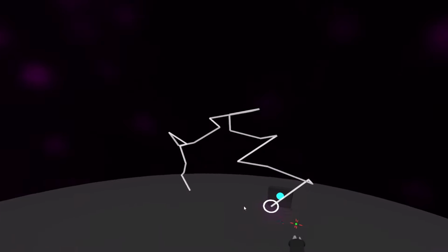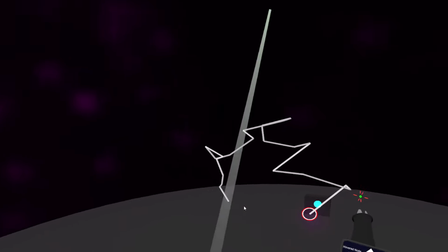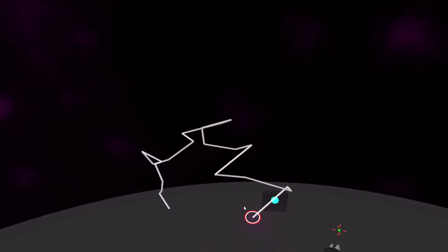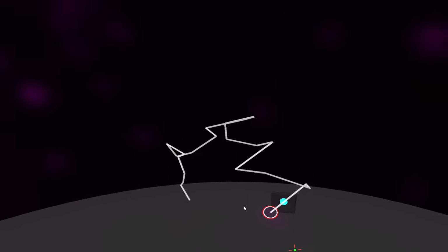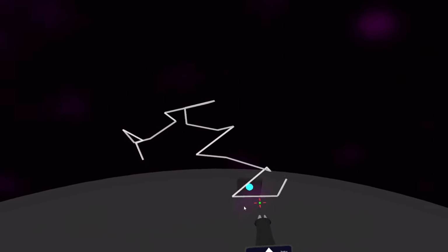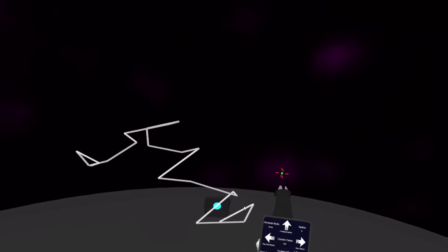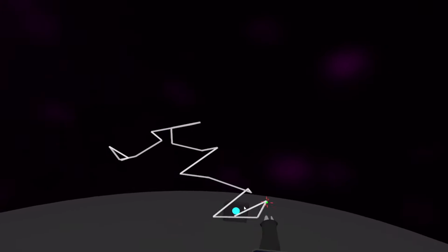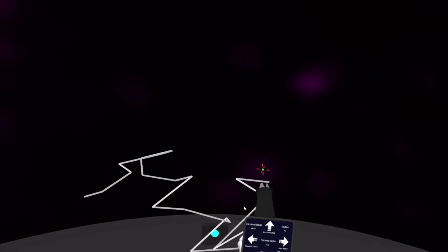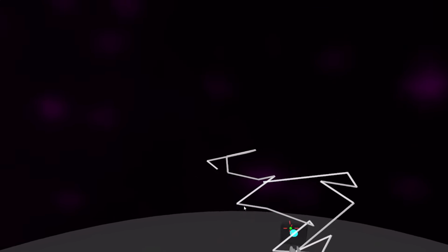And so I can come here and select this particular cell, for example, to keep tracking from here. Go back to menu, change the time direction to forward, and now I'm tracking in time forward. I go here, and then I just keep clicking onto the cell. It goes here, goes here, goes here, here, here, right?